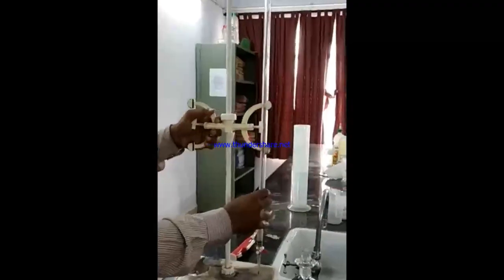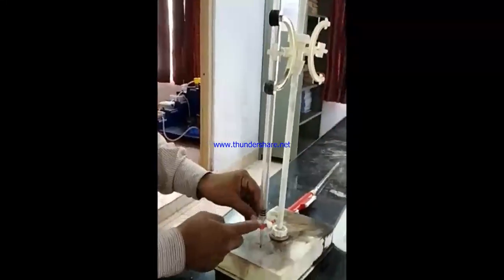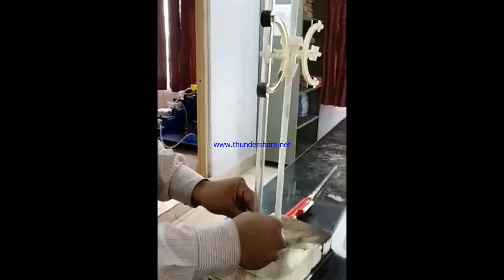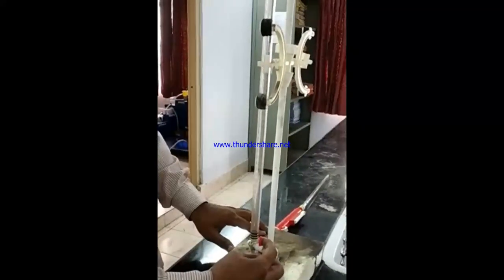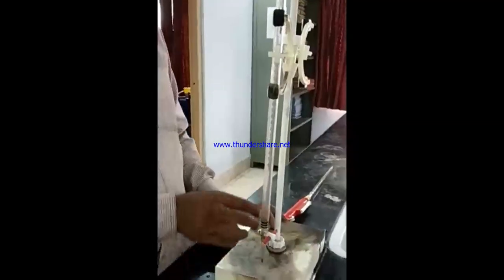This is the burette. This is the burette stand. We can adjust it so that the flask can be fitted at the bottom without any obstruction. Sodium thiosulfate will be put into this burette. This is the way to stop and start the flow of liquid in the burette. This is on, liquid will flow. This is off, liquid won't flow.